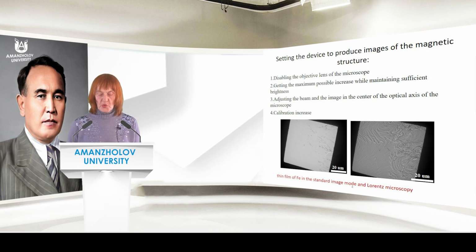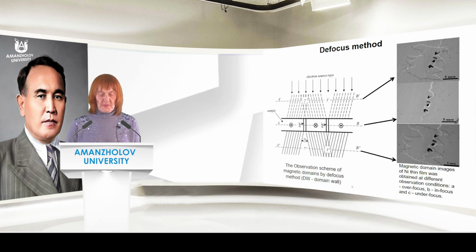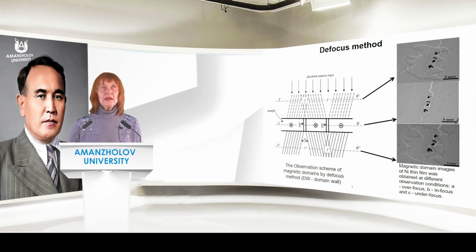An aperture can close on the split beams. Alternate domains look like light and dark areas. The dark domains correspond to the beam which is closed by the aperture. Both methods in detail and the theory of the magnetic contrast origin are described in references 10 and 11.